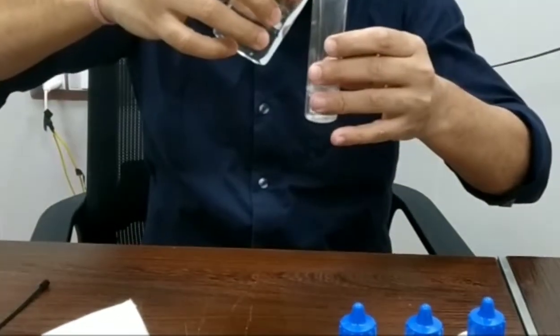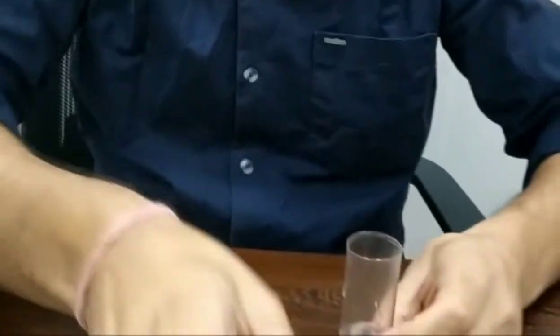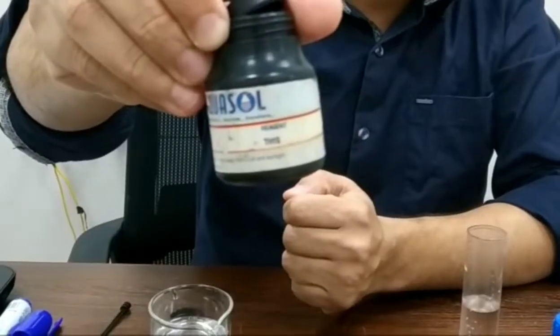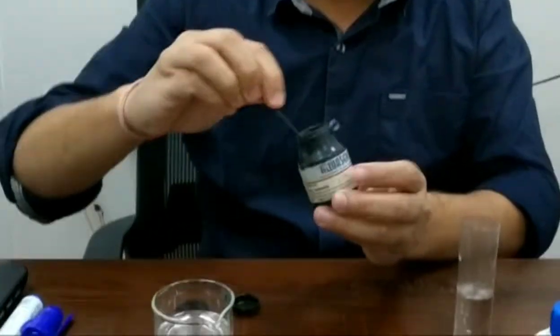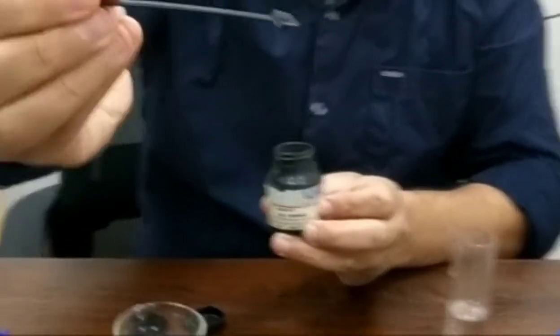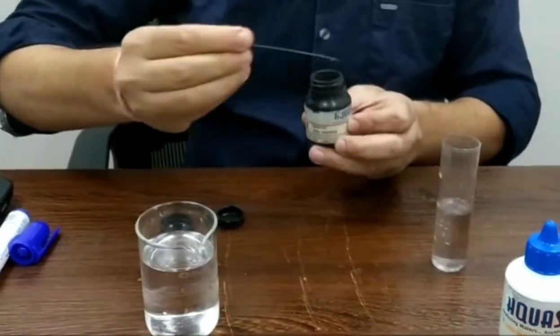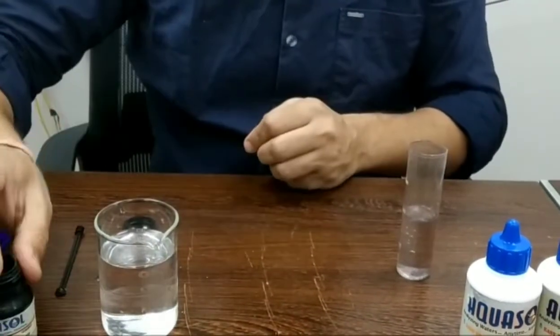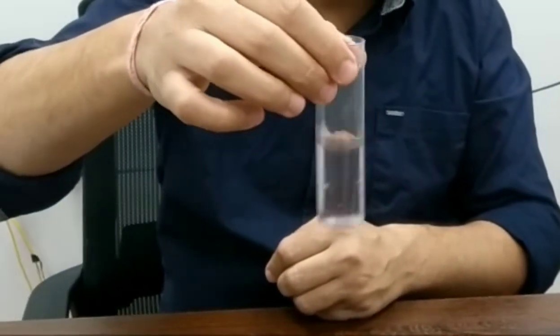For the purified water test, we are taking 25 ml of purified water in a test tube. Now we are adding the TH1S reagent — one spoon of this reagent using the tiny spoon that comes with the kit. After adding one spoon, we shake the sample. It is completely dissolved and there is no color seen in the purified water.